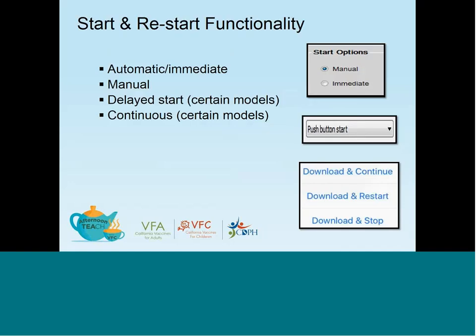Depending on the device that you've selected and are using in your office, you have more than one option as to how to program it for initial use and again after downloading data. Your options could range from automatic or immediate, manual, which typically means there's a push button start.